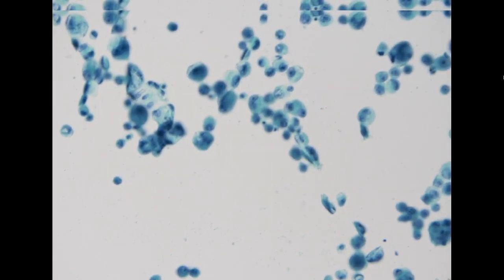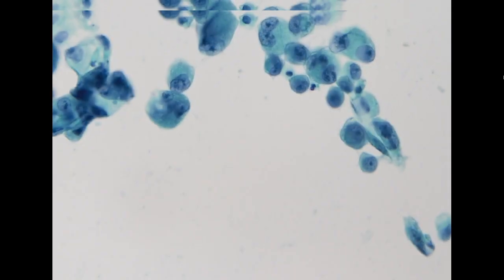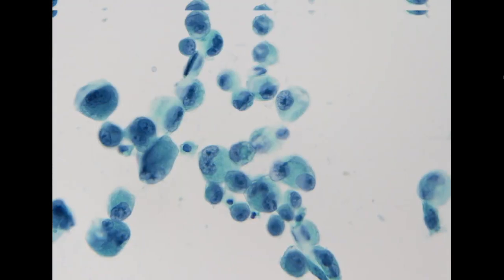On 4X, you already see it's much bigger than the usual mesothelial cells. When we go to high power, this is the classic morphology of a metastatic adenocarcinoma: vesicular chromatin, prominent nucleoli, abundant cytoplasm, sometimes with eccentric arrangement.